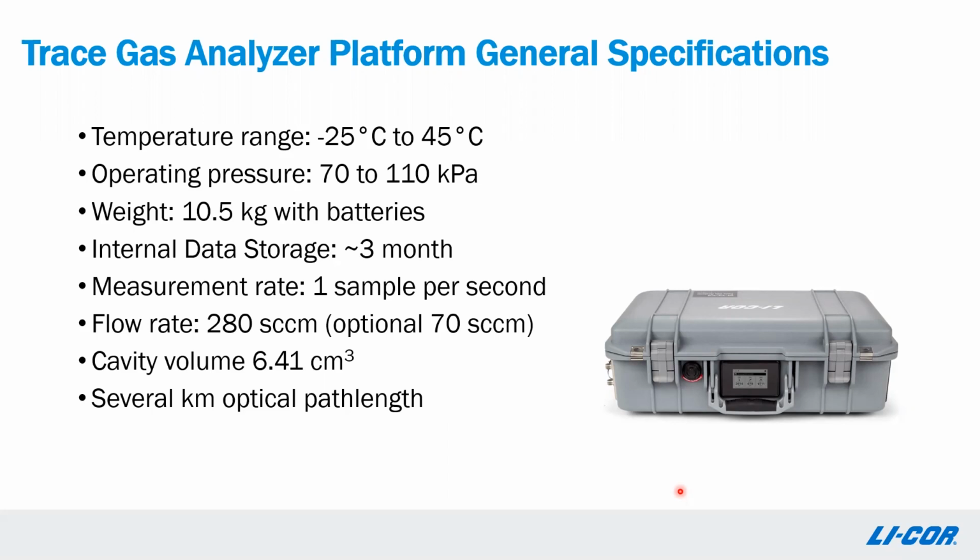So you're not diluting the sample in a large cell and waiting for that to exchange over a long period of time. And key to this technology, much like other cavity-enhanced systems, is that we employ an optical path length of several kilometers, and that becomes important when we look at the laser source that we're using for these instruments. In the next slide.